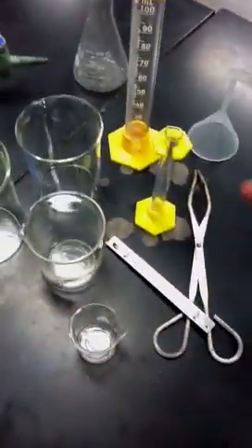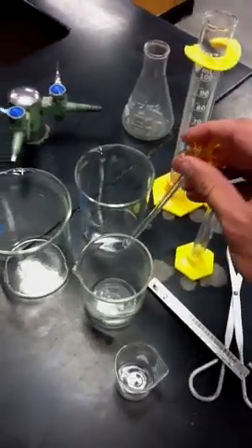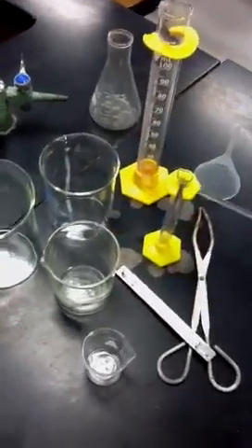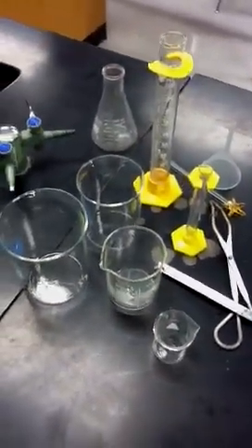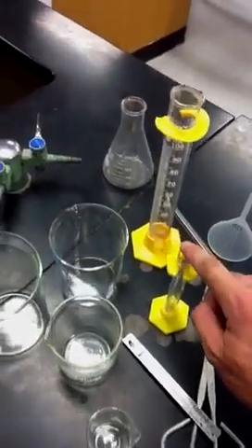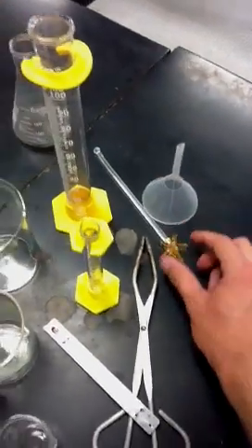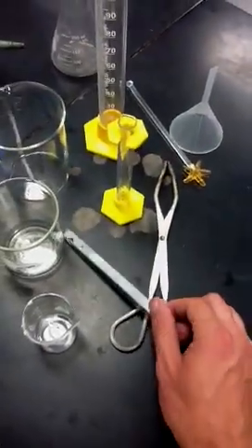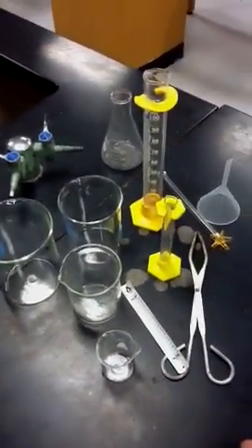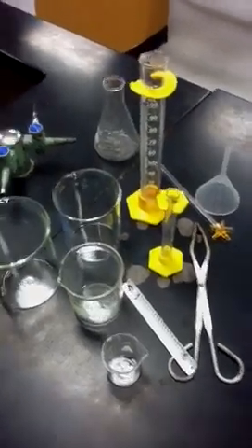We also have this thing right here — this is called a stirring rod. You hold it like this, stick it in something, and stir it up. Instead of using your finger, that wouldn't be very safe. So those are the different items — let's recap: these are beakers, these are graduated cylinders, this is an Erlenmeyer flask, this is a funnel, this is a stirring rod, these are tongs, and that is a thermometer. I'd pause the video now and quiz yourself on these before we go on.